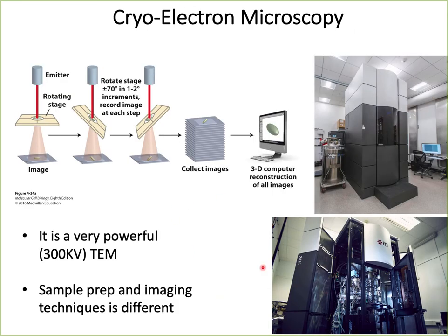So here we are looking at a kind of modification of cryo-electron microscopy, and these setups are amazing. At the low end, that's probably going to cost you something like $5 million, to the upper end, $15 to $20 million. We probably do not have any one of them in South Carolina. The closest is probably at the Duke Medical Center in North Carolina. And it's very state-of-the-art technology.